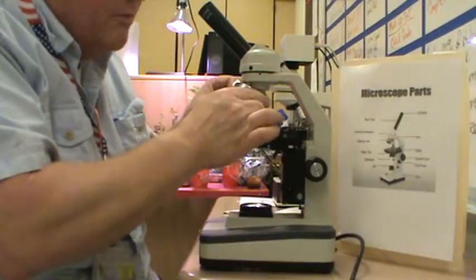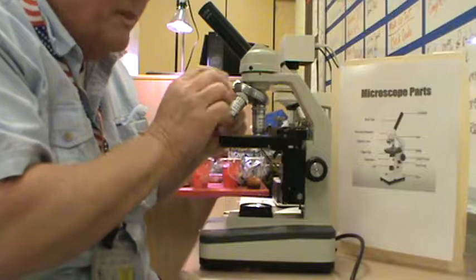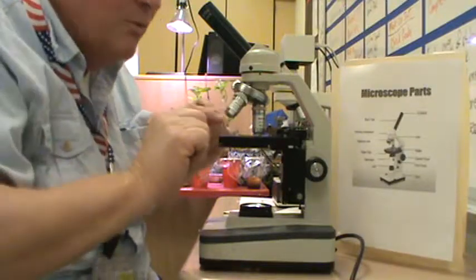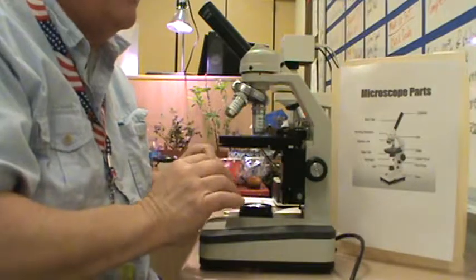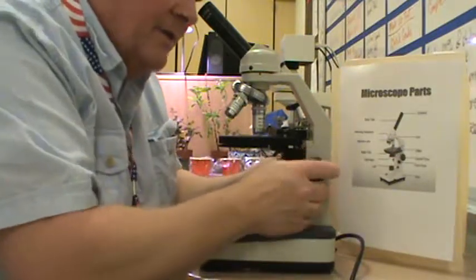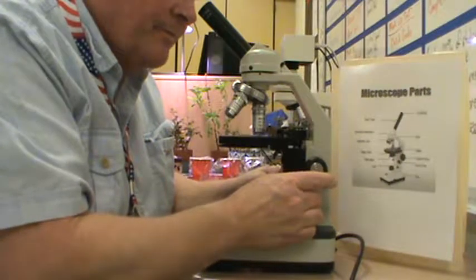If you rotate this down, you could grab that slide or that cover slip on that slide, and you could actually move it and throw the whole sample out of the way. So please be very careful when you're going to high power. In this case, looks really nice. I'm just going to use my fine focus.